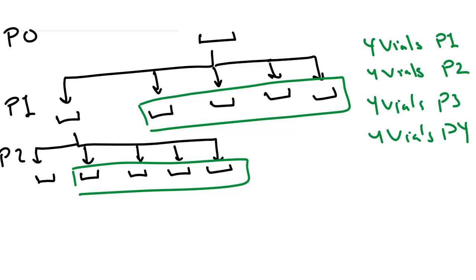Now, if that passage number is, for example, passage 30, well, I'm going to have all these vials down from passage 4, etc., to maybe passage 20, and I'll say, okay, passage 20 is a good place to start for my experiments, right? So what I can do is once I get passage 4, at this point, I can basically maintain these cells in the lab for a while if I have passage 20 cells, because passage 30 is sort of my limit. I'm not going to use anything above passage 30 for my experiments. So I get to passage 20 and I can split them 1 to 5 and then again 1 to 5, and then I have all these cells that I can work with for my experiments in the lab.